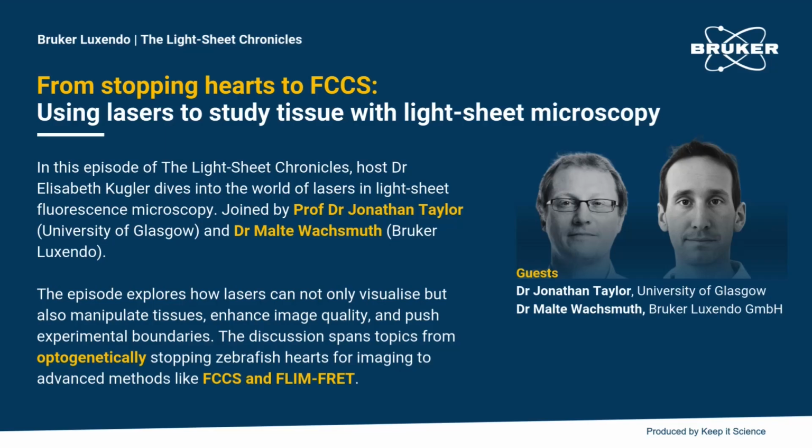But often, in order to get really good quality in terms of Z resolution, you then have to apply deconvolution to undo, or take into account, the effects of these additional side lobes. So your imaging acquisition pipeline becomes more complicated, but at the end of it, you do get better Z resolution over a wider field of view.